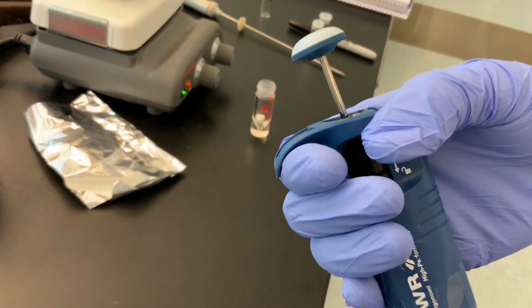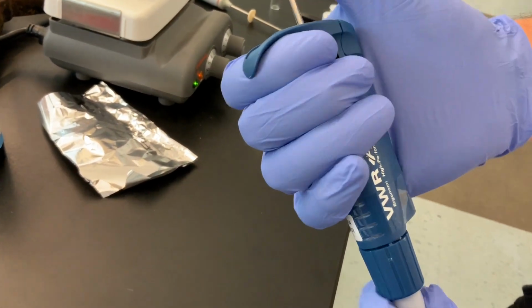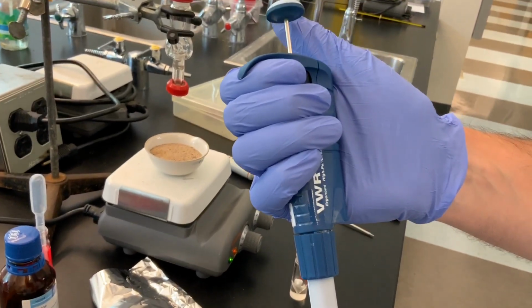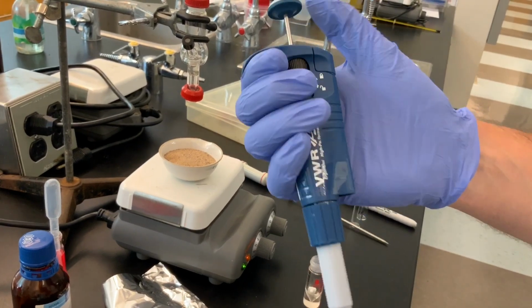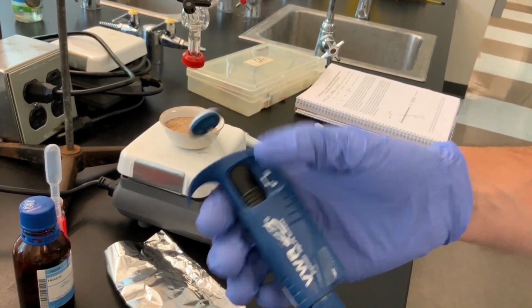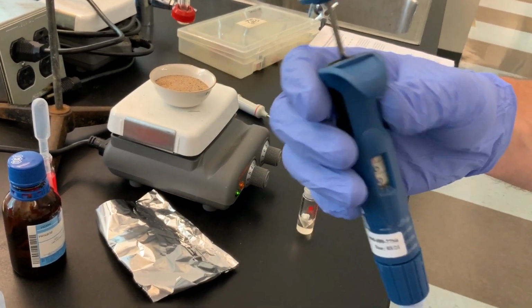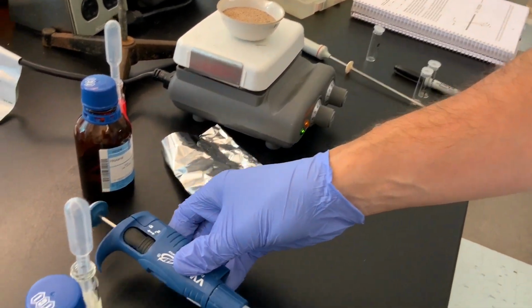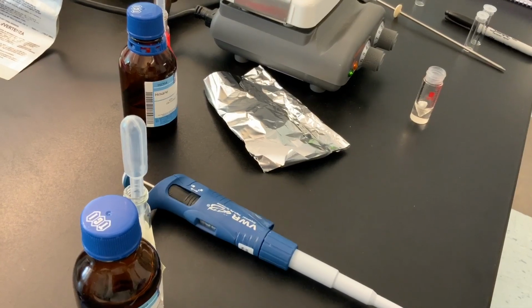All right, so it's pretty straightforward. It's something that you might use later on, especially if you're going to take the second semester component of organic chemistry lab, or in your future career. So these are very popular to use, and it's good to know how to calibrate them and to be sure that you're actually adding the proper amount of some liquid.